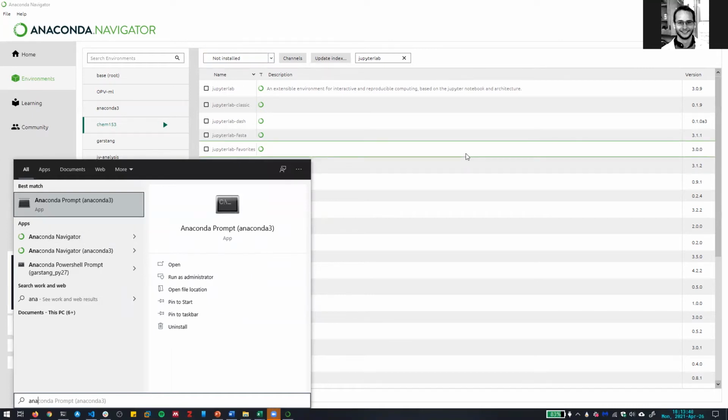Oh, there's another step where it asks you if you want to install Python into your path. Did anybody see that when they were running through the installation process? So I'm trying to remember if it's best. It's probably okay to go ahead and do that and click yes, put it in my path for now. If you already have Python installed on your computer for whatever reason, that might start to screw things up on Windows especially. But we can cross that bridge when we get to it. So for now, yeah, just click yes for add Python to path. And if you didn't or skipped it, we'll figure it out.